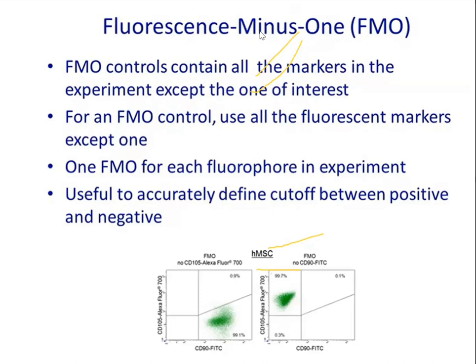How do we differentiate between positive and negative? For example, I'm telling you from the beginning, there is a comp bead bottle commercially available. These beads have two populations. One bead will have nothing on its surface. The other beads have anti-kappa molecules on the surface. Any fluorochrome-tagged antibody will have kappa to it, correct?